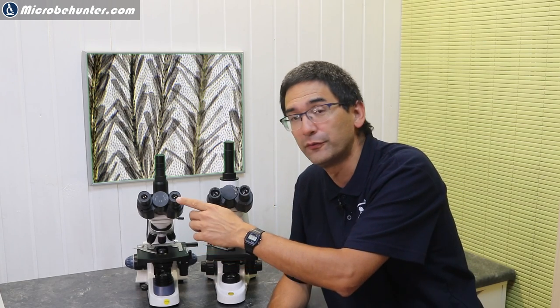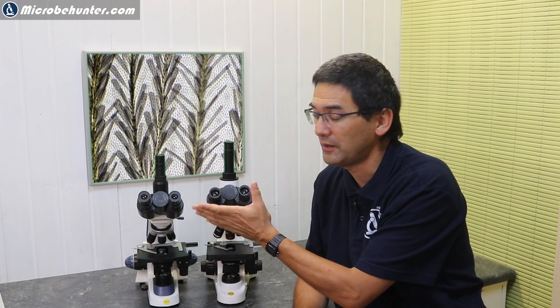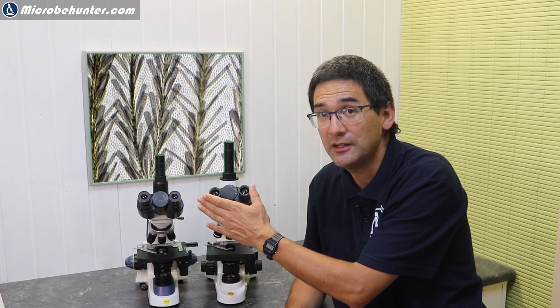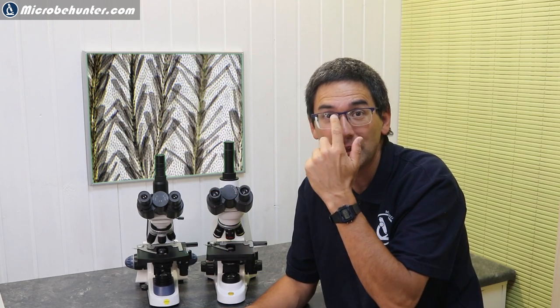You can also use them much better when you're wearing glasses because you do not have to go as close to the front lens to see the full field of view. So the eyepieces here are a little bit more comfortable to use. Of course you can always exchange the eyepieces also of this microscope if you want to and buy yourself additional ones to upgrade. The field of view, however, of both eyepieces is the same—the field number is 18. So when you look through those microscopes you're going to see the same amount or the same area of the specimen. This does not change, but you're able to look through those eyepieces with a slightly larger distance, which is convenient if you have eyeglasses.